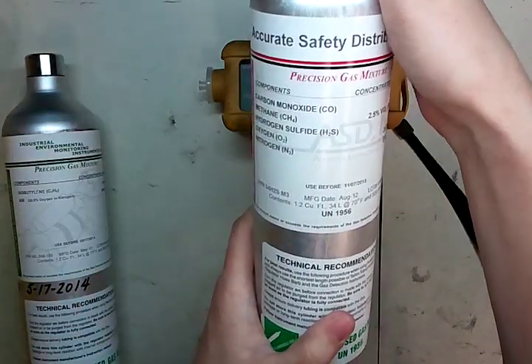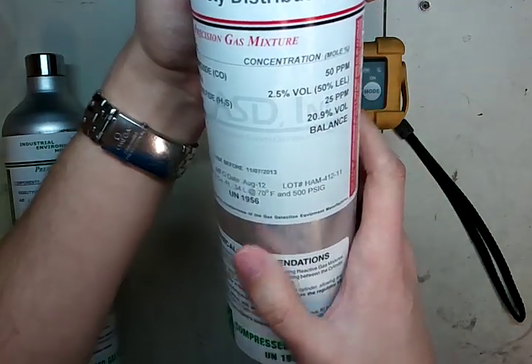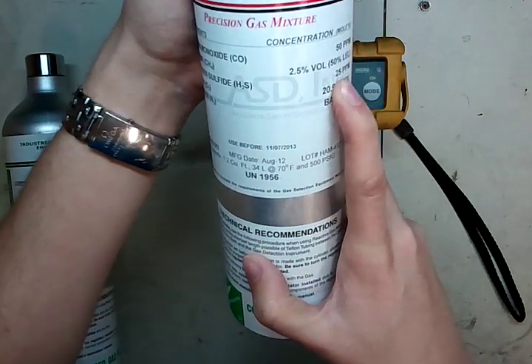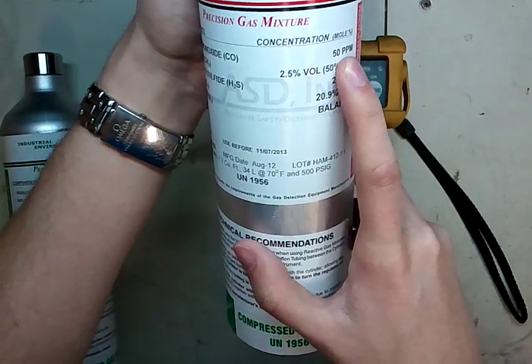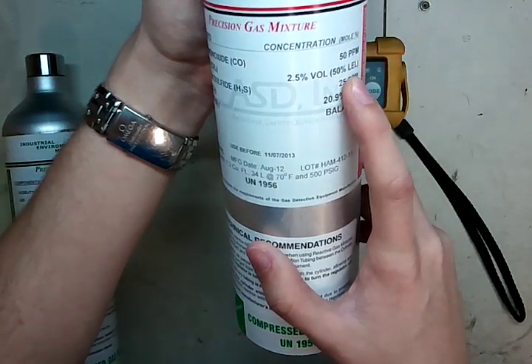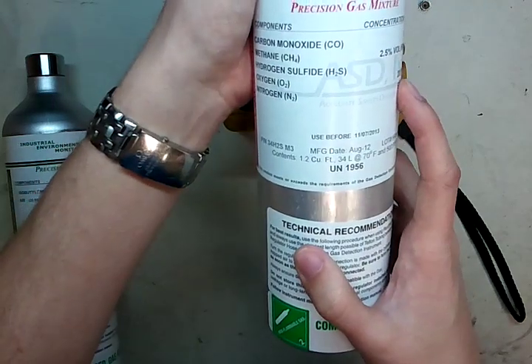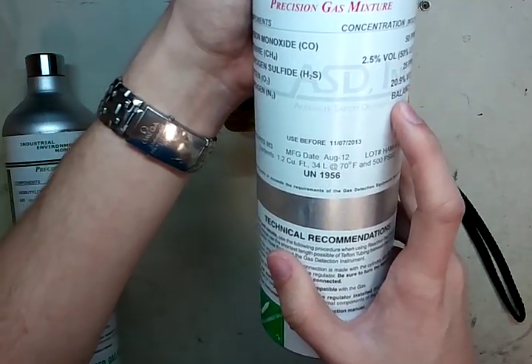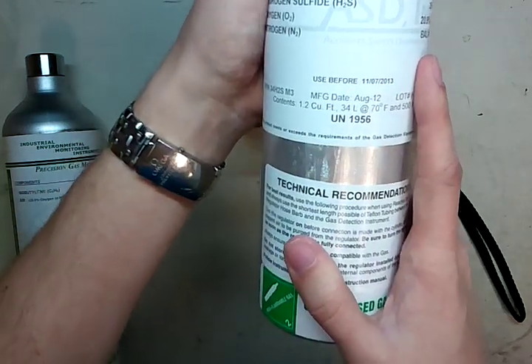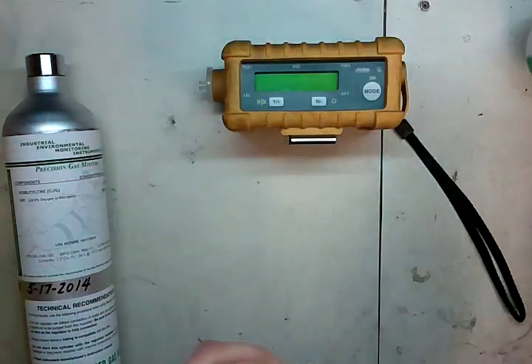This one's a little bit different than normal. There are two different blends out there for Ray — they have a 10 parts H2S and they also have a 25 parts. This is the 25 parts H2S: 25 ppm H2S, 50 ppm carbon monoxide, 2.5% by volume or 50% LEL methane, and 20.9% oxygen. So we're not going to be checking the oxygen sensor with a nitrogen balance. Always check your use-before date and make sure your gas is good on both cylinders.